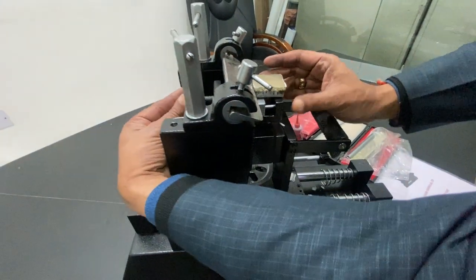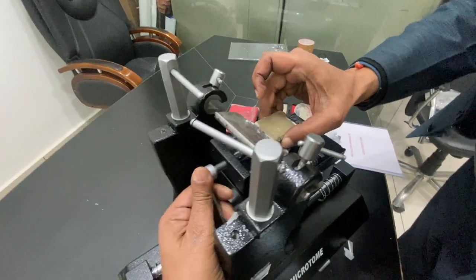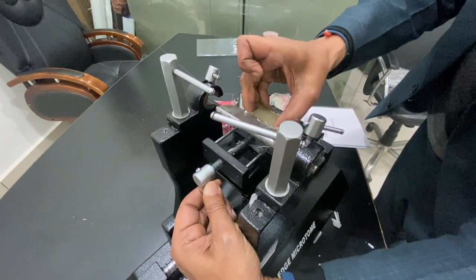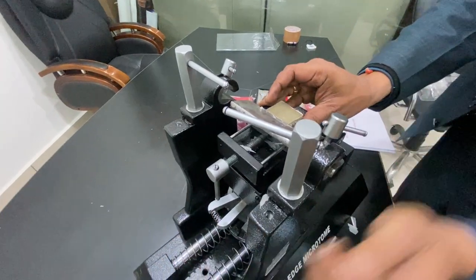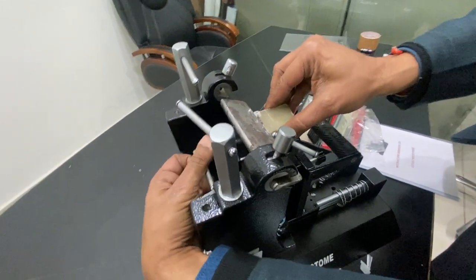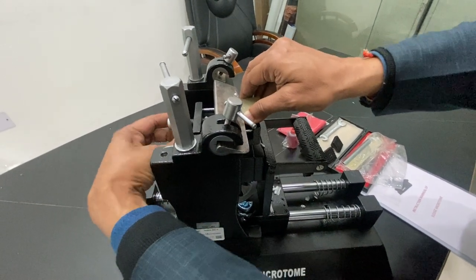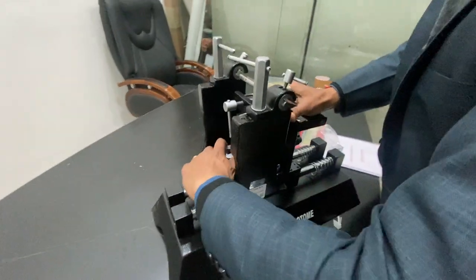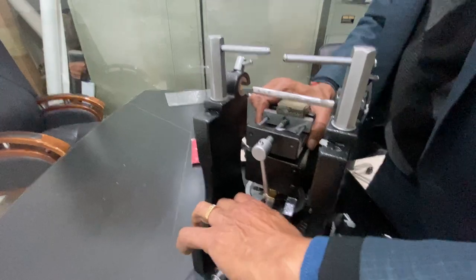When I loosen this one screw, the block will move up and down like this. I can make it so that it is level on both sides. Just see, here I am adjusting this block so that it is not one side up or one side down. It is just both sides up, and then I can move the block up and down by this. There are levers which I can bring down, and I can bring up also.